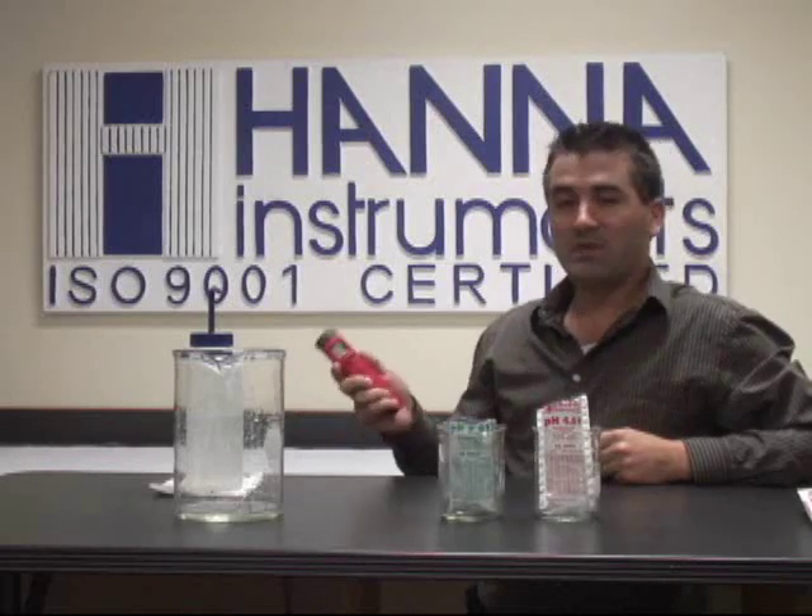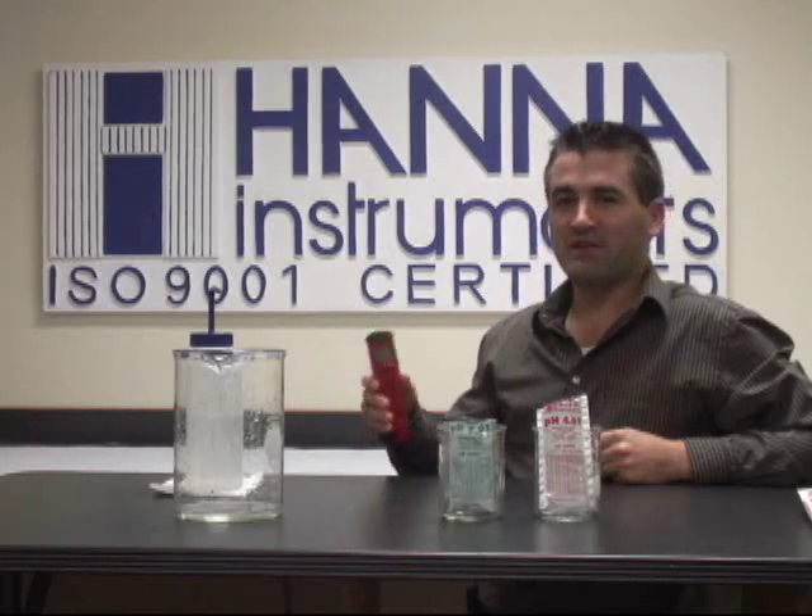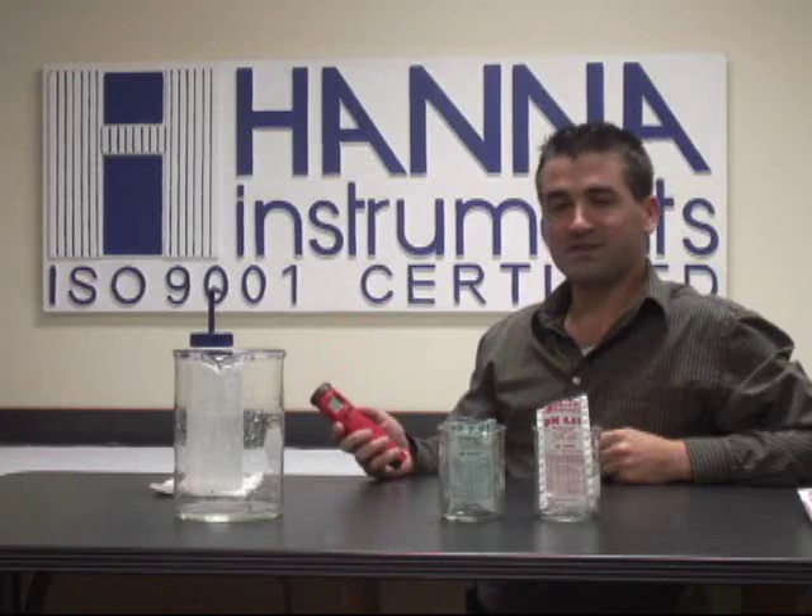Welcome to another training video presented by Hanna Instruments. I'm Michael Sylvia and I'm going to be showing you how to calibrate our pH testers that have auto calibration. That would be our 98182, 981828's as well as the combo testers.